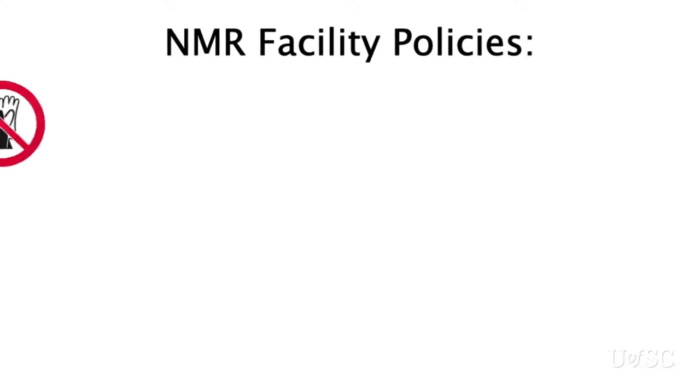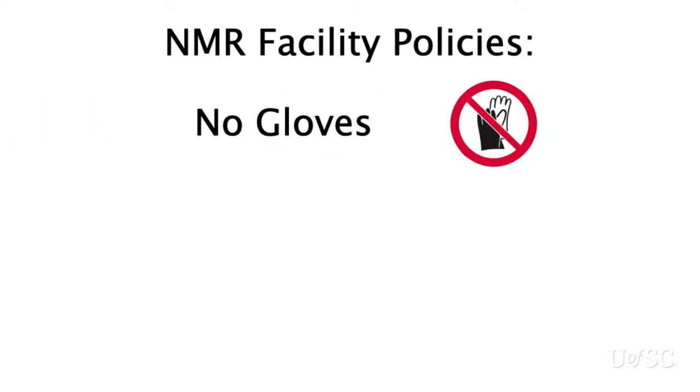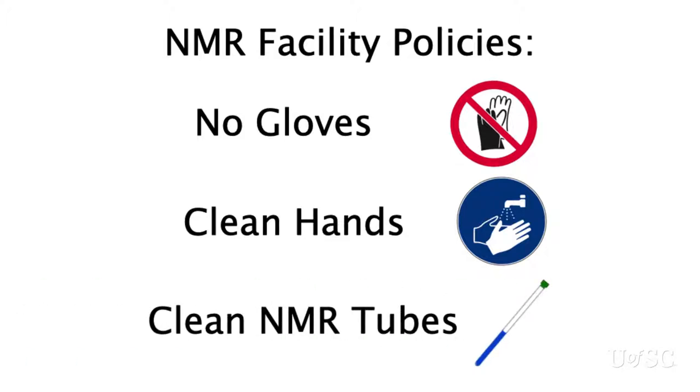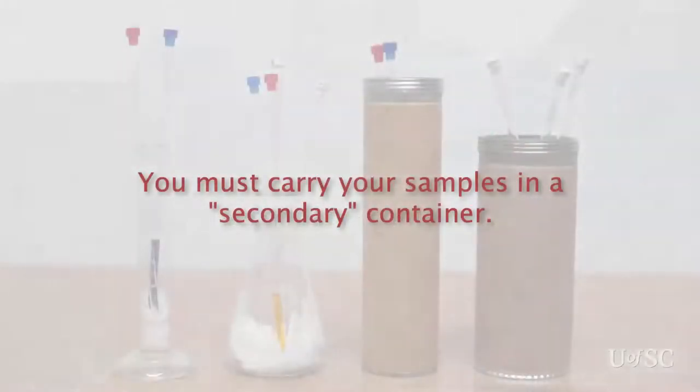You should never enter the facility with gloves. Gloves may protect you, but if they are contaminated they are spreading contamination to everything you touch, like door handles, spinners, keyboards, computer mice, and pens. Instead you should be washing your hands before leaving your lab. Dirty hands will transfer to the NMR spinners, which will contaminate the spinner stator. The outside of your NMR tubes must also be clean of any contamination. Dirty NMR tubes will transfer to the NMR probe. Repair costs could easily reach several thousands of dollars due to such abuse.